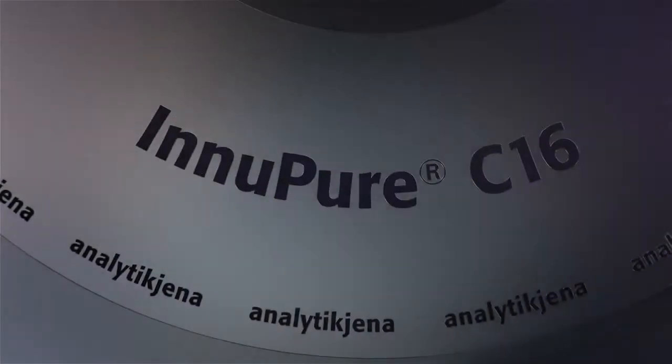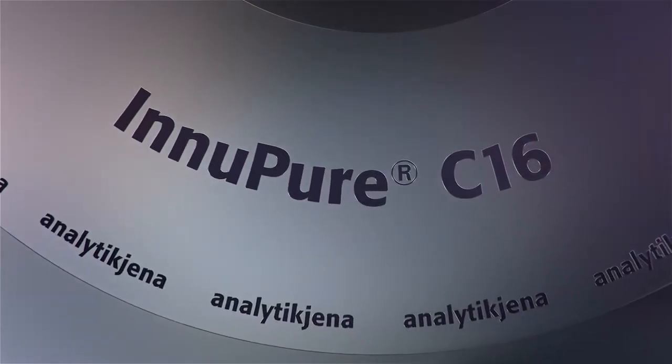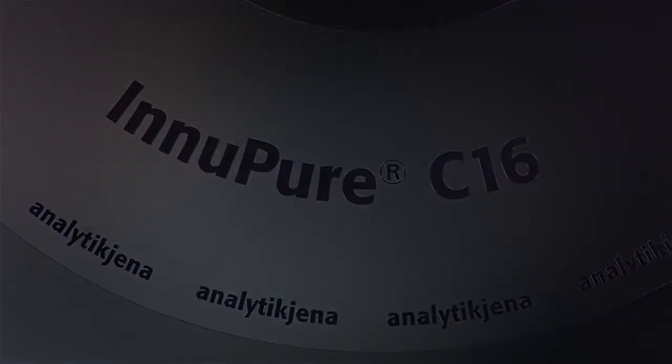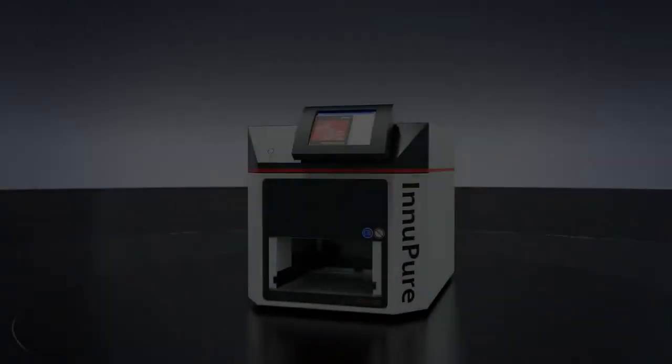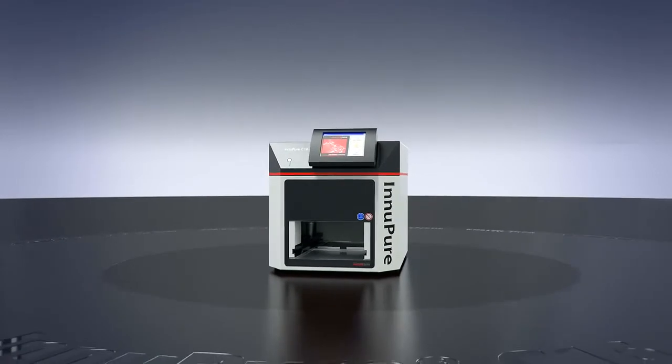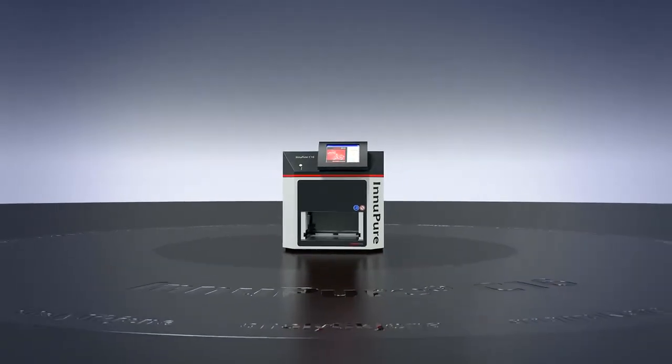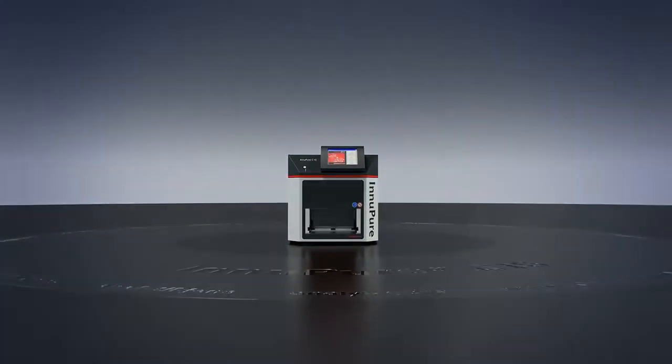InnuPure C16. The perfect system for every laboratory.